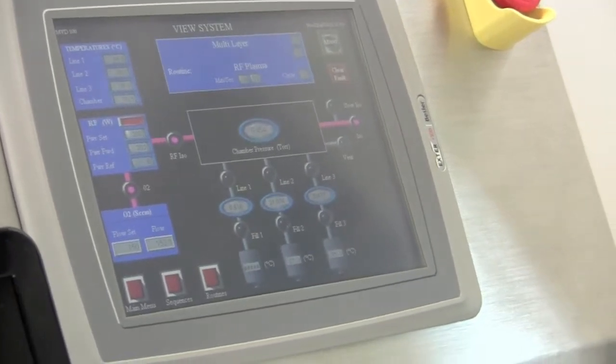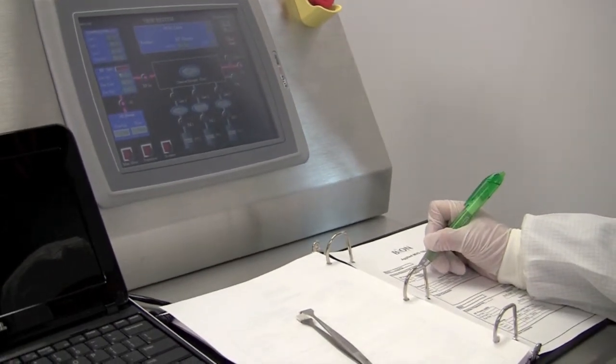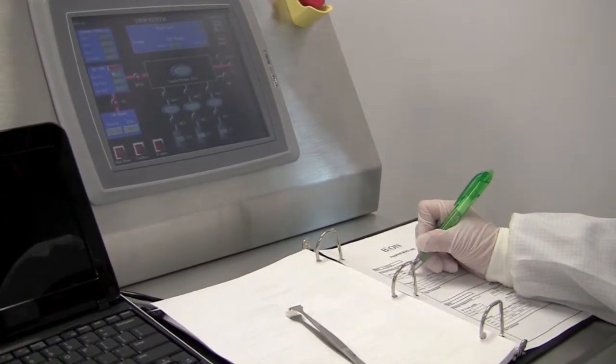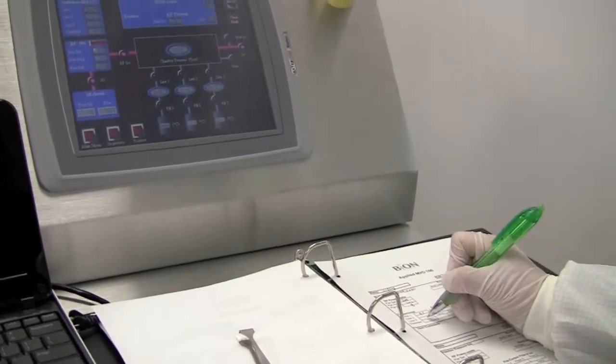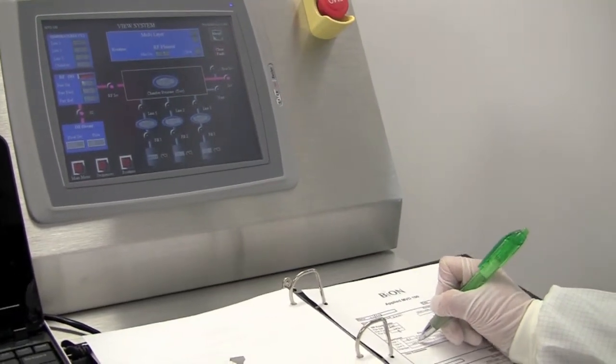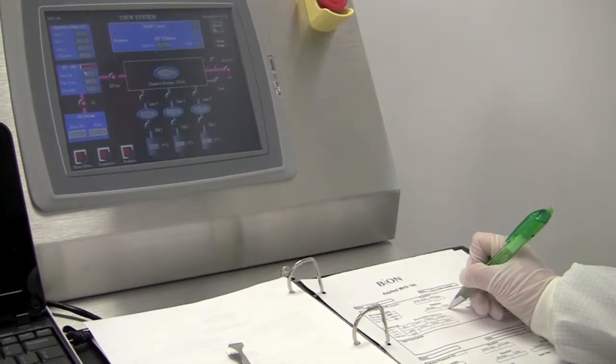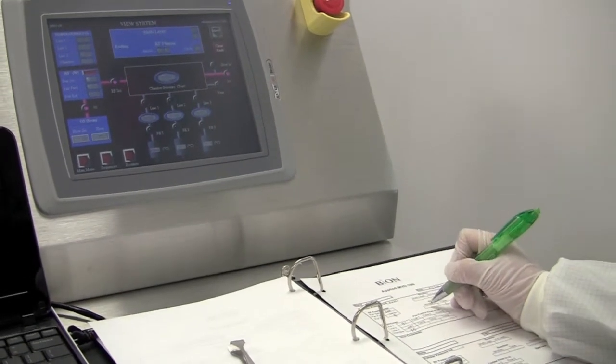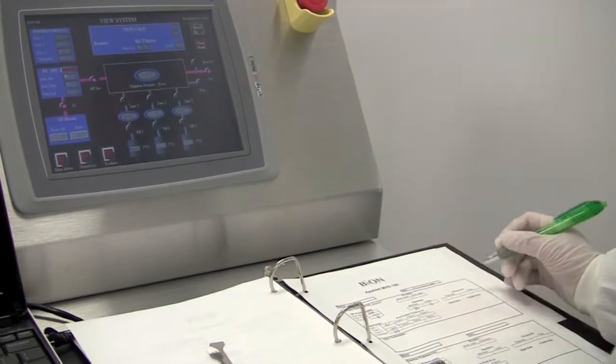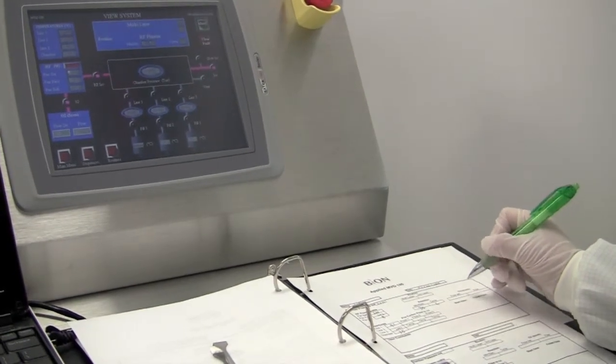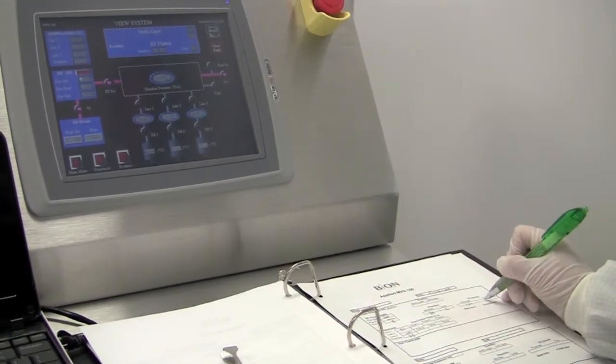So during that time, you write down the information of the RF power and also the temperatures for line one and line three, and the chamber temperature, and also write down how many reaction cycles and the time for each cycle, and also the flow rate of the oxygen. This is 150, 152.